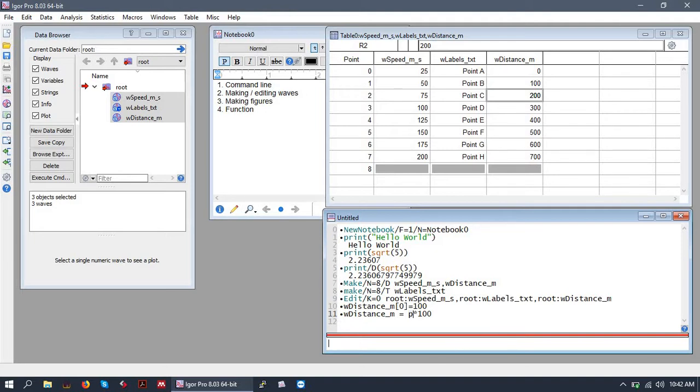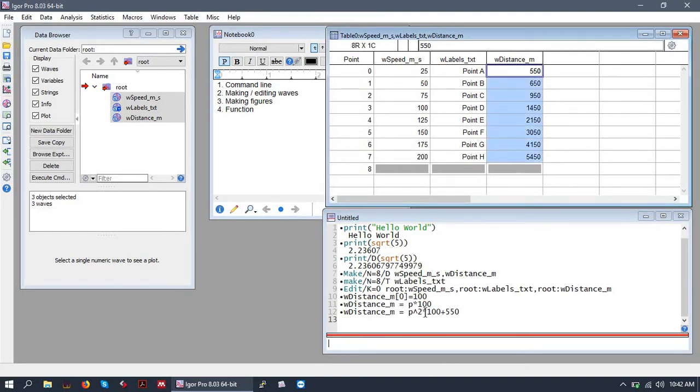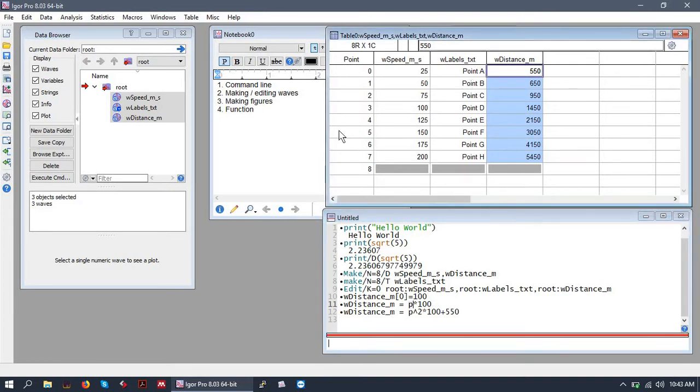You can even do things like you can get as complicated as you like. So here's our crazy distances from squaring P and multiplying it and whatnot. So become familiar with the indexing variable P and Q if you're going to be doing two-dimensional waves.